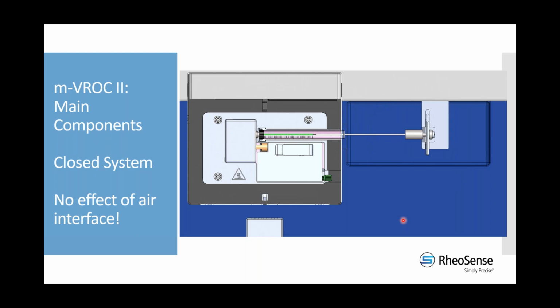So if you would like to use the recovered sample for the next run, it is totally fine, but please first remove those bubbles by pushing them out and then connect the syringe to your chip and set it up for the next measurement. Because the presence of bubbles in your sample can interfere with viscosity data and ultimately can lead to poor measurement. Okay, as I mentioned, up to 80% of the sample can be recovered. But please keep in mind that the recovery strongly depends on the viscosity of your sample. For lower viscosity samples, we expect to recover more.